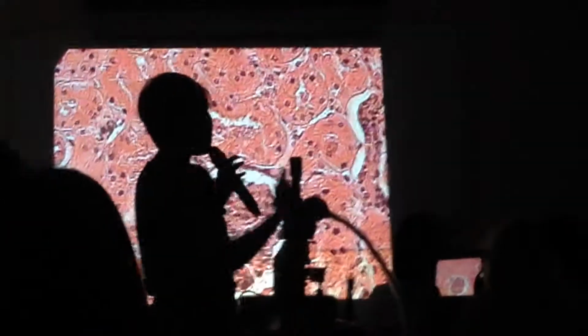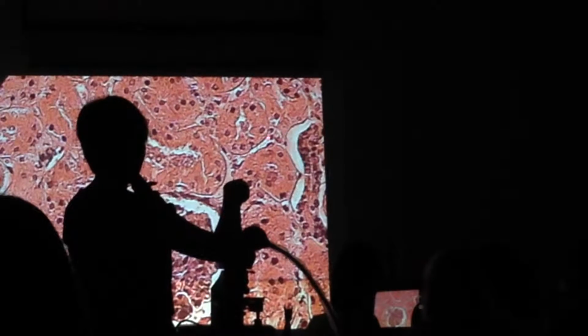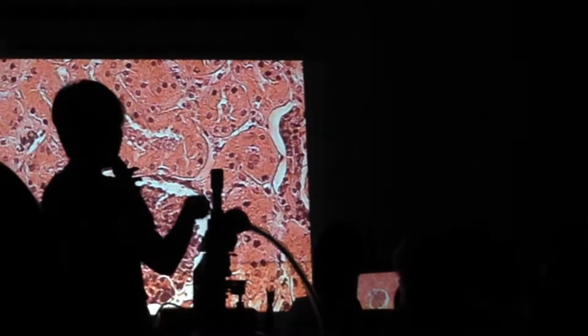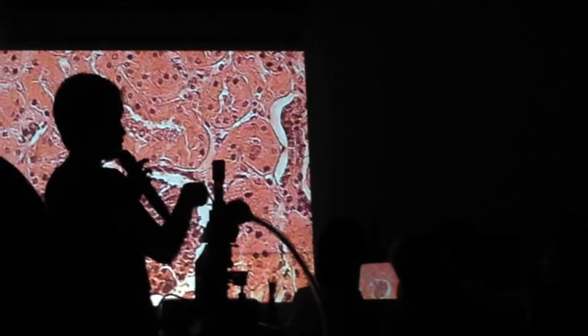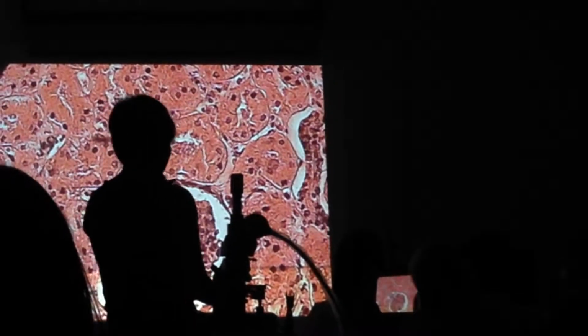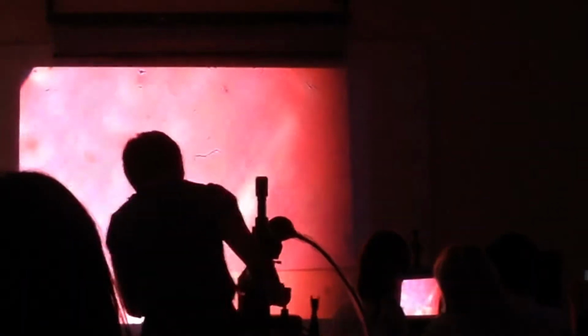So you see a continuum of reversible to irreversible changes. So from cellular swelling to tubular necrosis, you can see that within the same tubule. So this is your cellular swelling. If you have any questions, just raise your hand or clarifications.